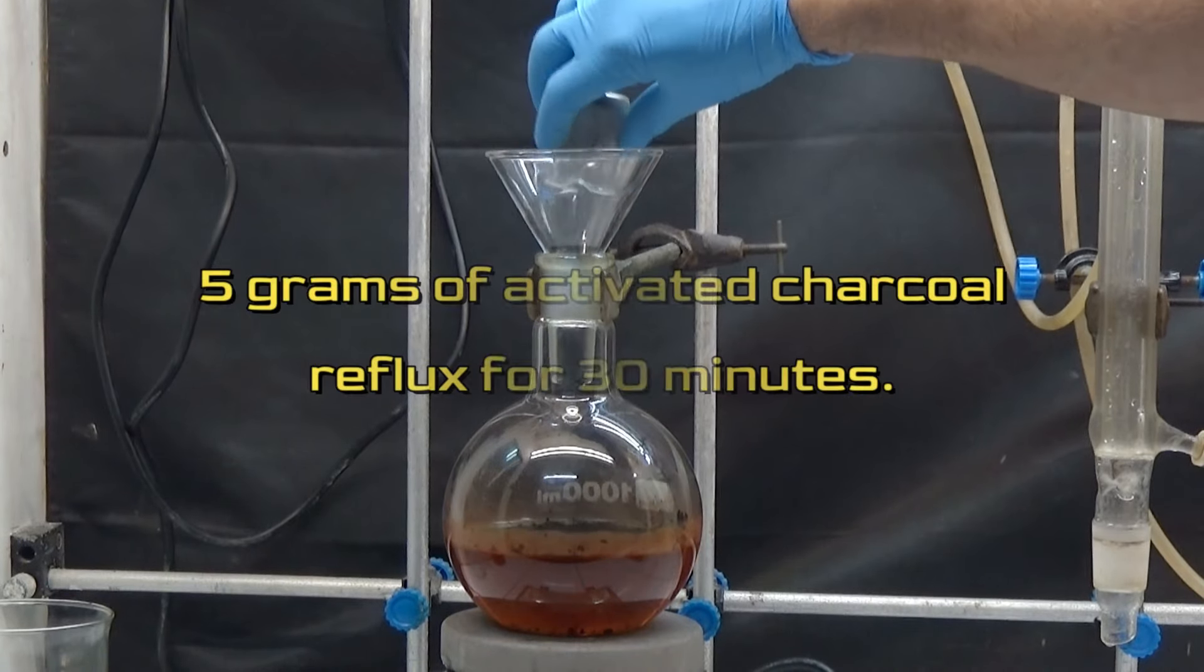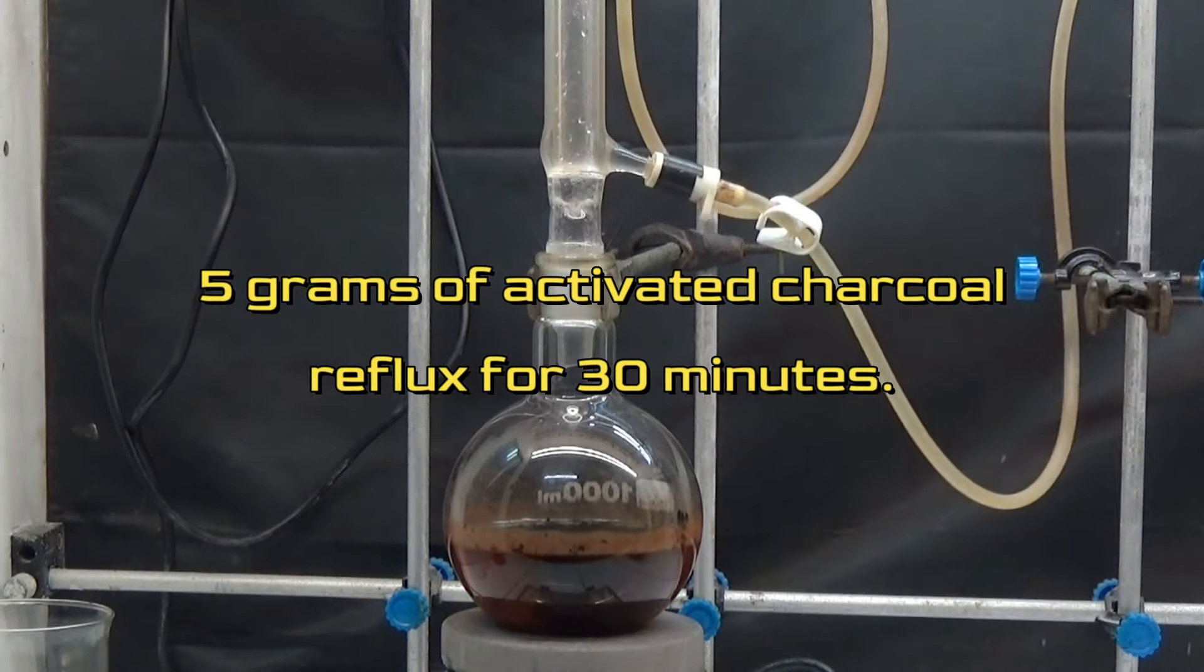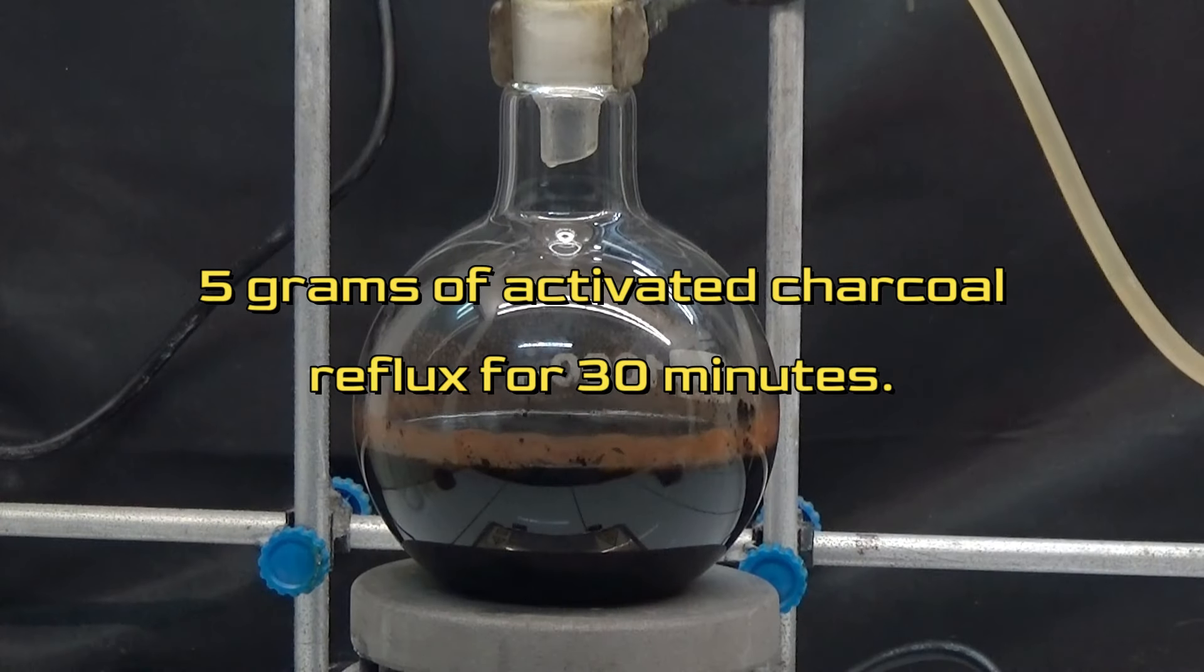To eliminate resins and discolor the obtained product, we add 5 grams of activated charcoal and heat it at reflux for 30 minutes.